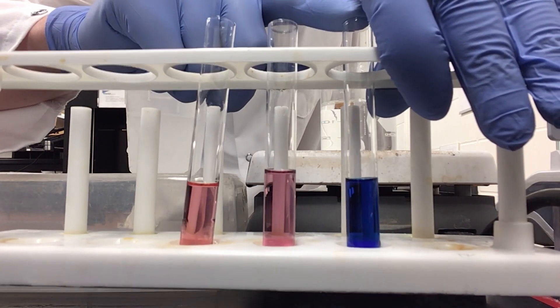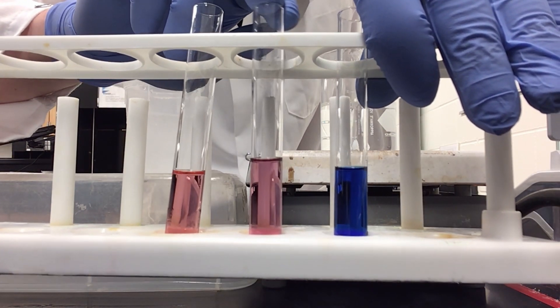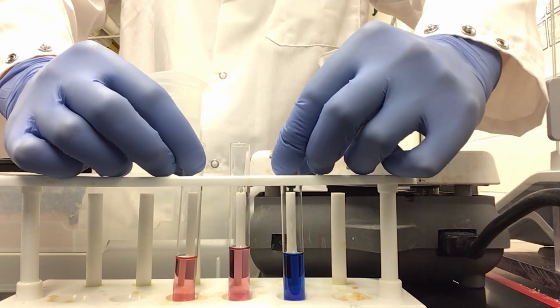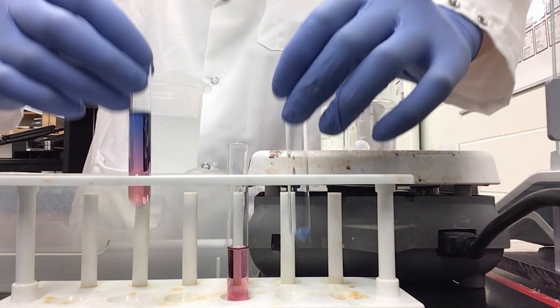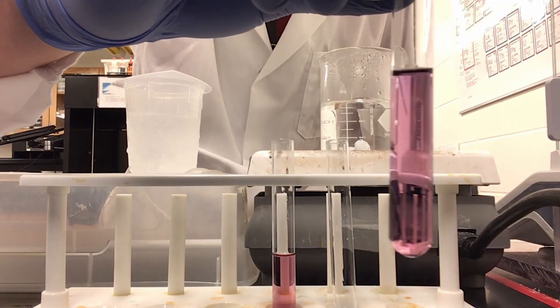As you can see, we have a very dark blue solution from the hot bath. We have a slightly in-between darker pink and a lighter pink from the ice bath. Now I am going to take these two solutions and combine them. And now we have a very good purple solution.